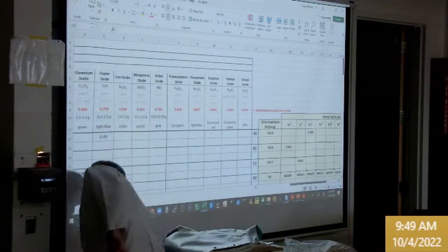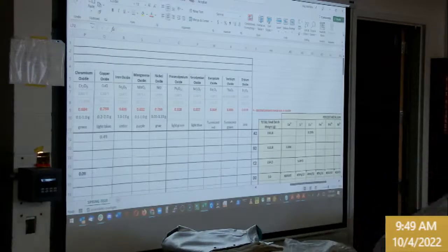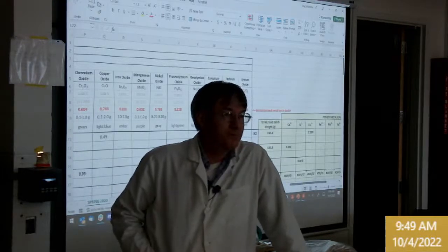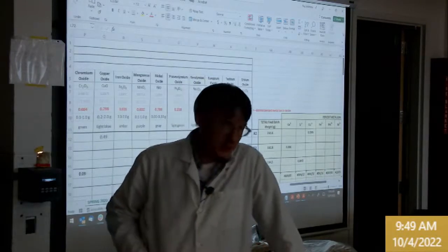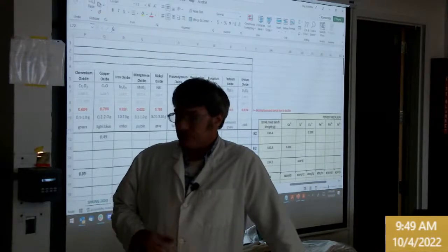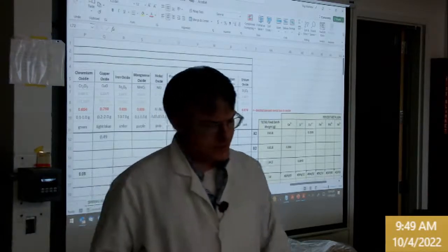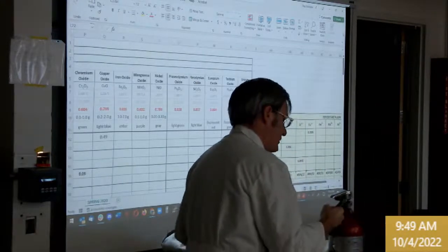And before I get the volunteers, last but not least, the firemen. I've never had to use the firemen, but Dr. Rake comes up with contingency plans. I've done this with, well, it's got to be between 1,000 and 2,000 engineers over the last 12 years. So we've done this a lot. I've tried to engineer as much safety as I could into this, but eventually something could happen. So this is a carbon dioxide fire extinguisher, and people are real squeamish about fire extinguishers in an official capacity.